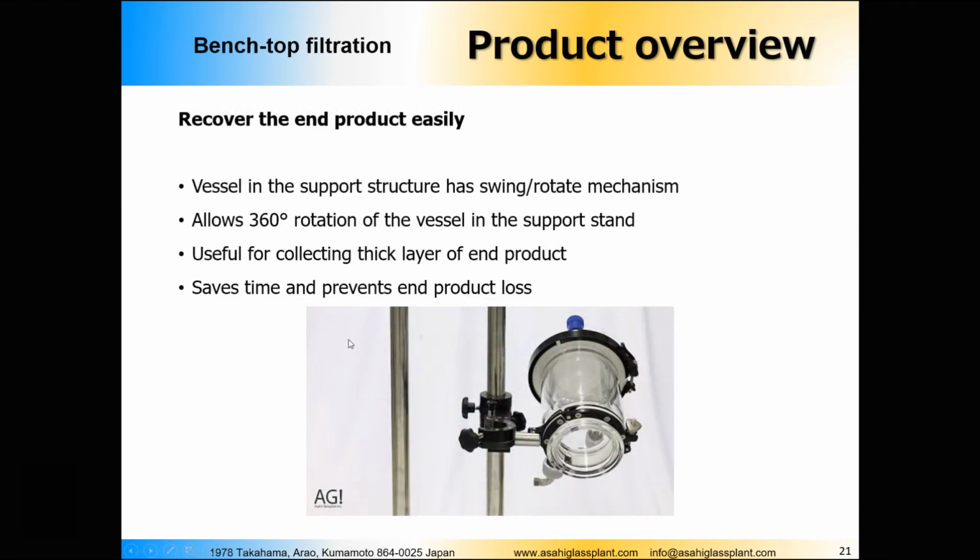When I was talking about the discharging, I was saying that we can easily lower the bottom part. But what is also important to mention is that we can lower the bottom part together with the vessel, and we can also rotate the bottom part with the vessel, as you can see here in the picture.